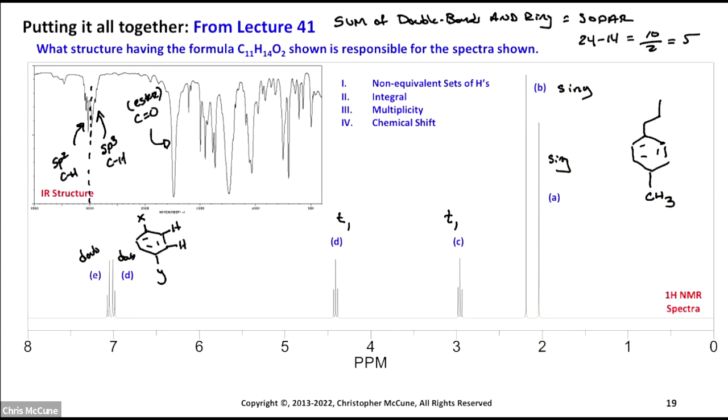So I need to have 2 triplets. I'm going to put an oxygen in here and see if that helps. Yeah, so that'll bring one of those around 4 to 4.5 to the ester side. And then on the other side, we're going to have the ketone-like side. And so that gives me at least something I can start working with here. I guessed a little bit.